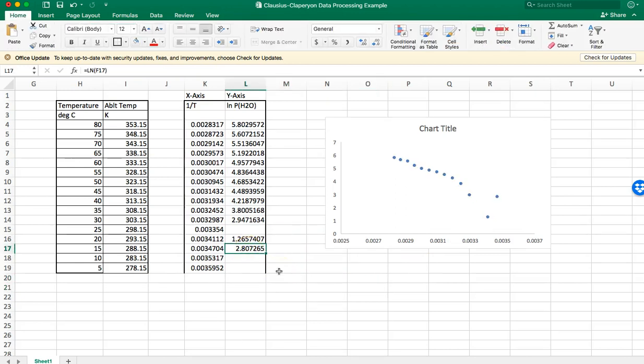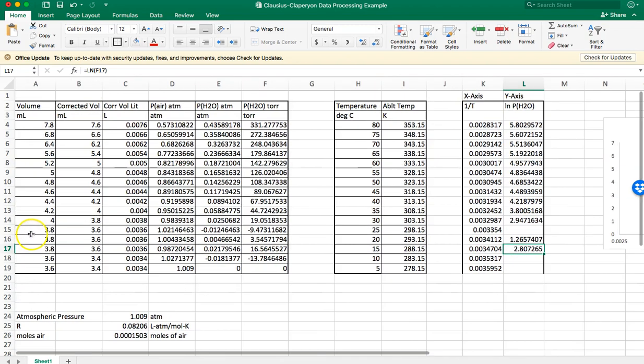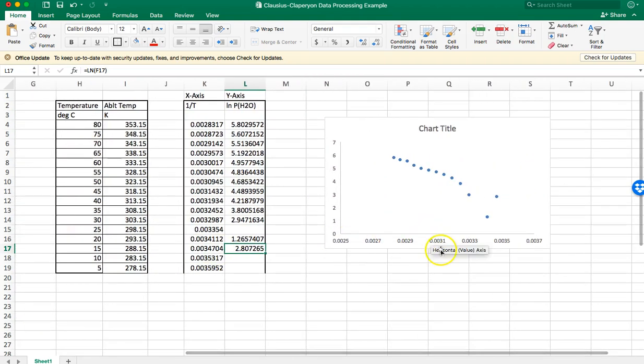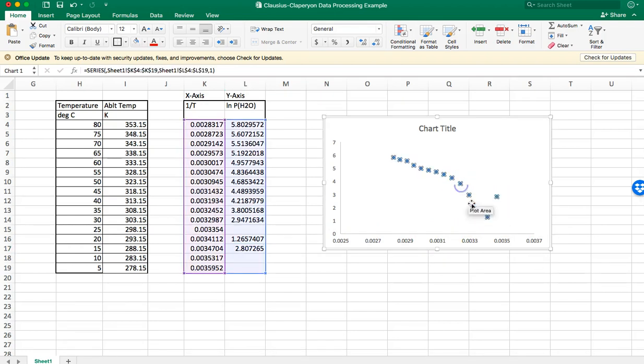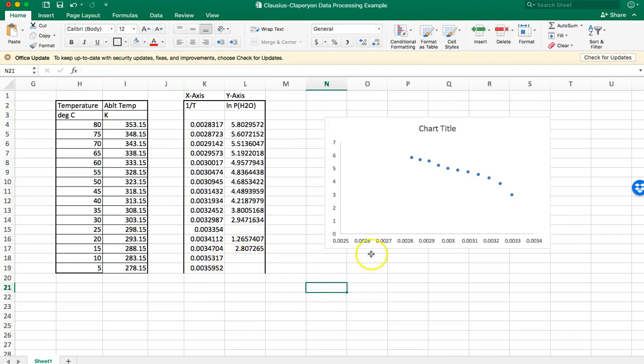What we'll do, so some of these ones, especially when you get to the lower data points, because it's so hard to see that volume change, but the temperature constantly keeps changing, we're introducing a lot of error. So what I'm going to do is I'm going to get rid of these last 2 data points from the data set, because we can easily visually see that they're not following the trend. So the way you want to do that is you just click on the data points. That's what I did. It highlights where the data came from. We go to the middle. Sometimes you get lucky and you can get both at once. But all I did was drag up the y-axis, and then you drag up the x-axis. And what it does is it just removes those points from the graph.